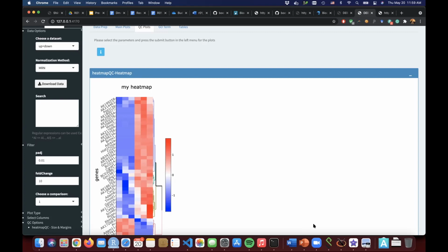If you're curious about how it is doing that, you can look at their papers about the fold change calculations. But yeah, this is a very big issue that you have to be careful about, especially when the counts are low. For example, you have only 10 reads coming from a gene and the other is 0. When you divide without adding anything, the fold change will be infinite, 10 divided by 0. But even if you add 1, if the read count is 10 and the other is 0, 11 divided by 1 will be again 11-fold change.